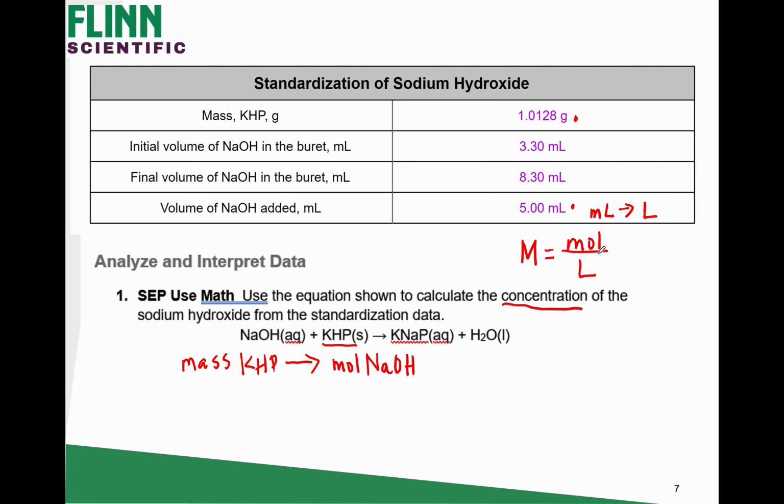Ladies, don't forget about significant figures. Make sure your answer is in the proper number of sig figs. All right, so then the next thing they're going to do is show you a video of the actual titration of how you can determine the molarity of vinegar, also known as acetic acid.